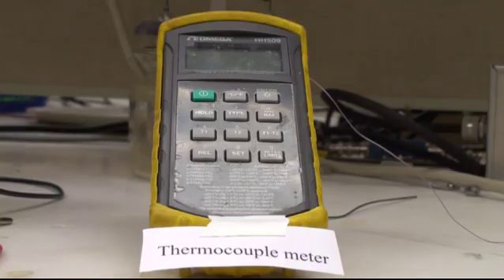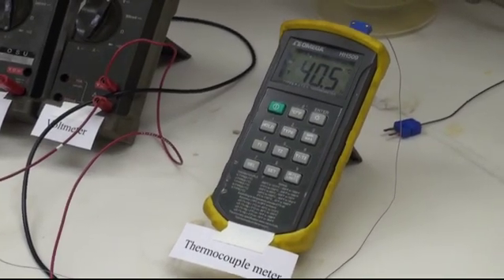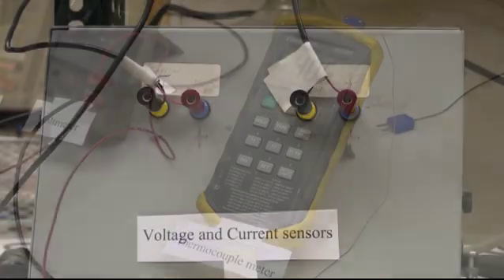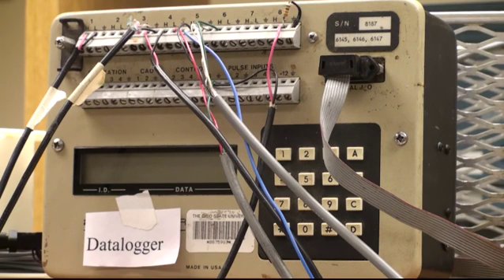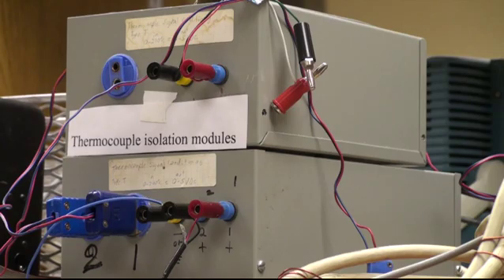We typically want the electrical conductivity as a function of temperature. To do that we have extra components. The components that you need would include a voltage and current sensor, a data logger, and thermocouple isolation modules.